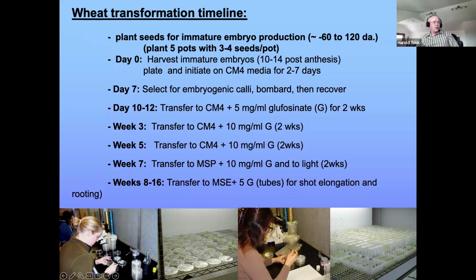And then here is Hongju in the middle. She is my lab manager. She'll go through and select the proper tissue that has good embryo production. So she'll do this, and then we will bombard those about a week later. And then we start to recover those, where we'll take them on a series of different medias.